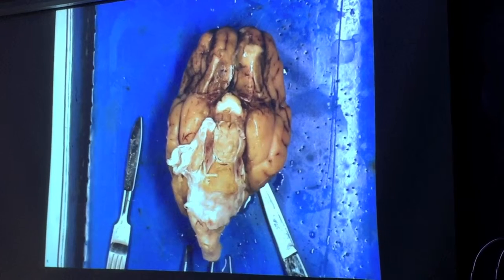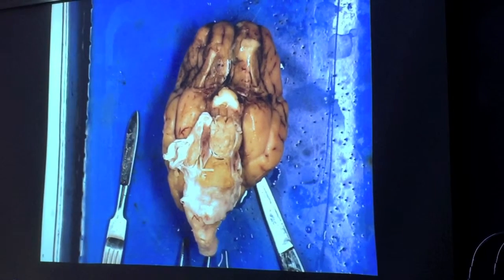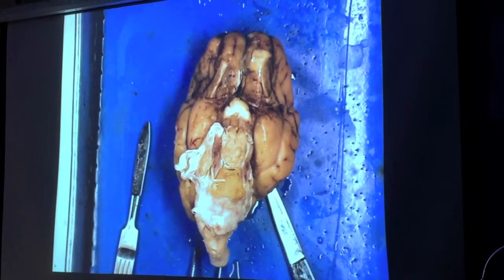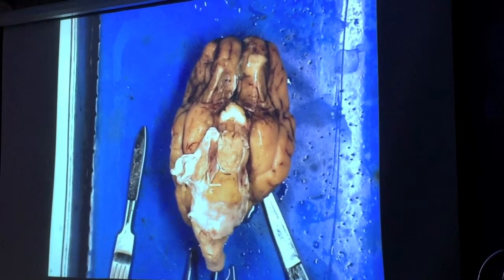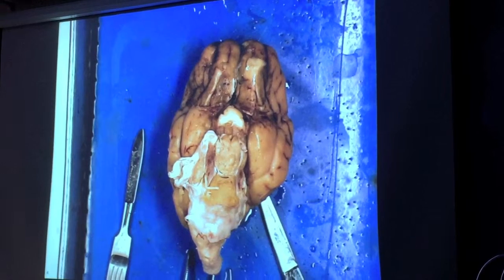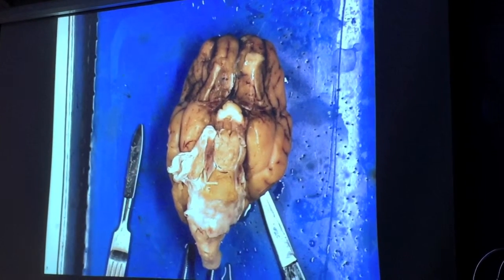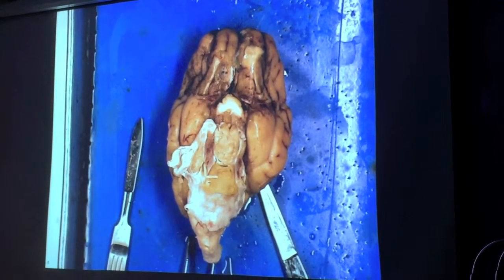Interesting thing is that the olfactory bulbs in a sheep are about as large as the olfactory bulbs in a human. However, the human brain overall is much, much larger. And what that means is we have a much poorer sense of smell than a sheep does. So for humans, smell is still very important, but we don't perceive it anywhere near as sensitively as other animals do. Dogs can smell things at levels that even some of our most sensitive chemical sensors can't detect.